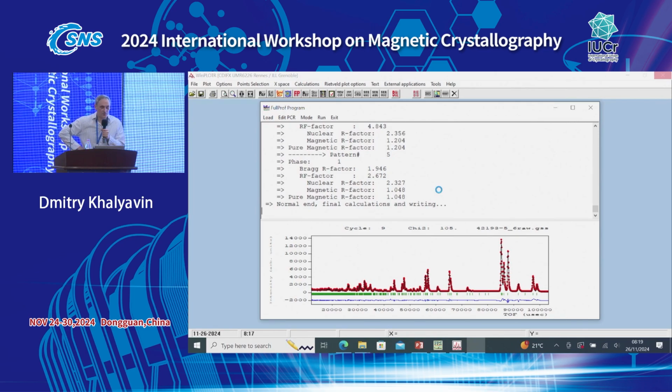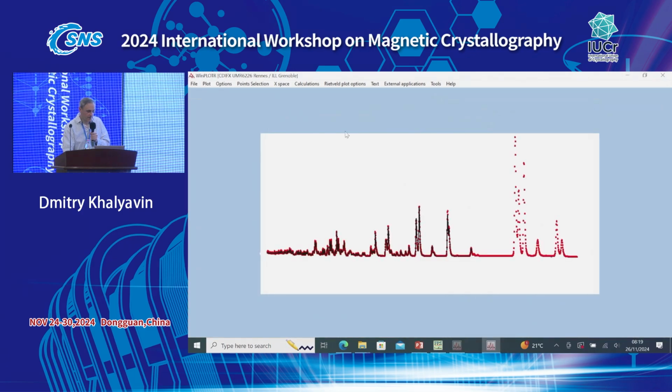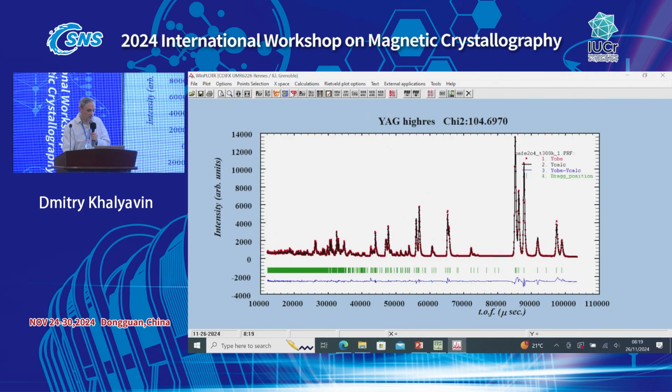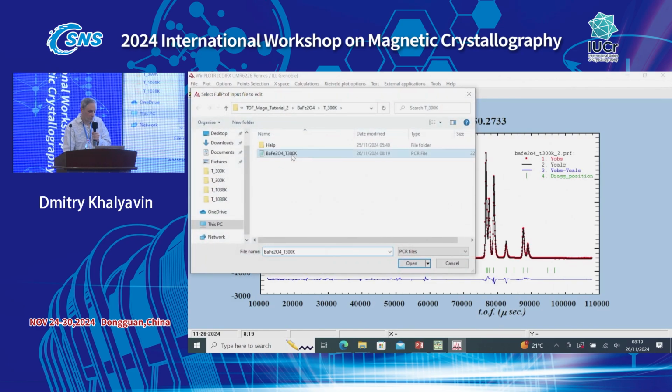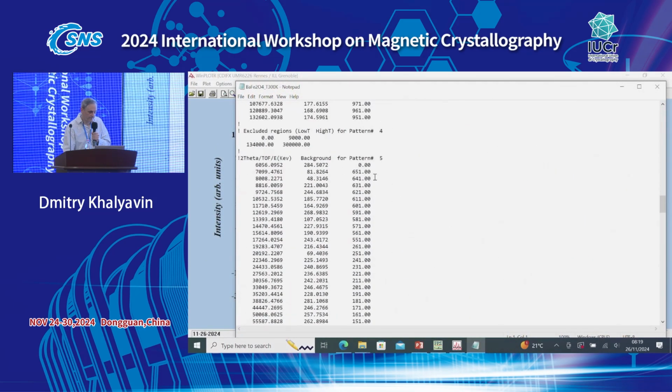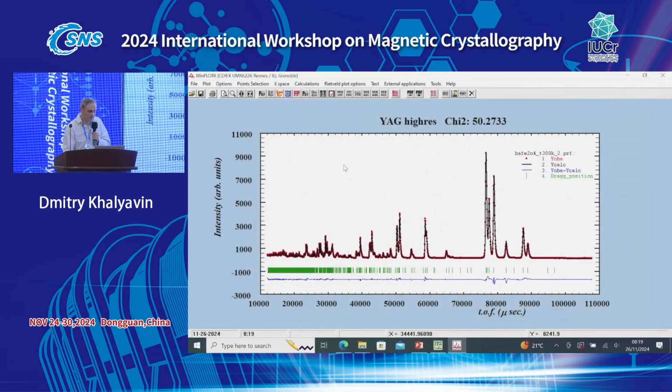Okay, it's converged, so it didn't complain, you see, so no problems to refine X component, Y component for magnetic moment separately. So let's see how different they are. Okay, so that is something we can have a look at, other banks. Okay, they're not bad, right? So let's see the final result of our magnetic moment. Okay, they're slightly different, yes. Let's see how statistically significant the difference is.